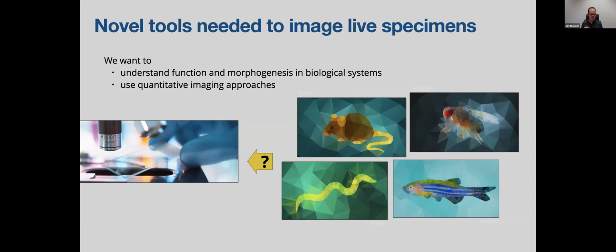So basically not building a microscope like maybe depicted here on the left and then say, oh, you have to mount your sample on a cover slip, otherwise it won't fit into the microscope, but basically have the sample dictate how close the microscope can be to the sample, and rather develop mounting techniques that are ideally suited for the sample, but may not be ideal for the imaging, but then still find ways around that.